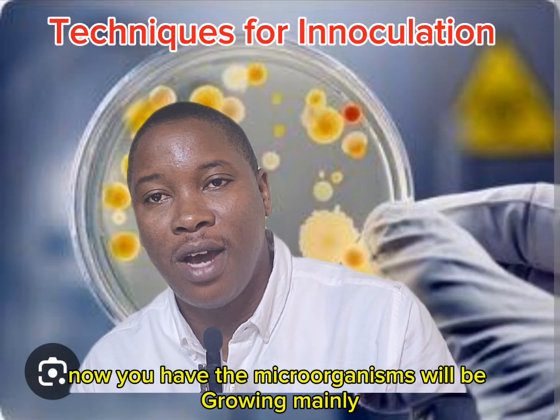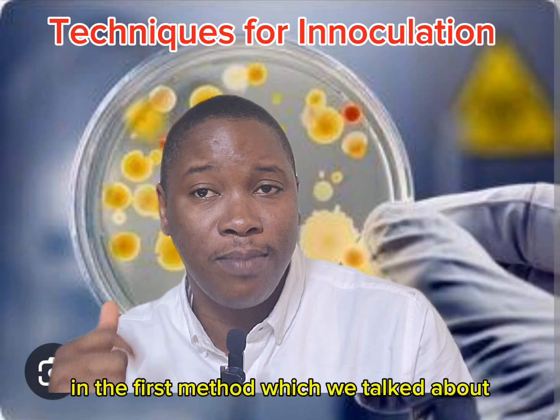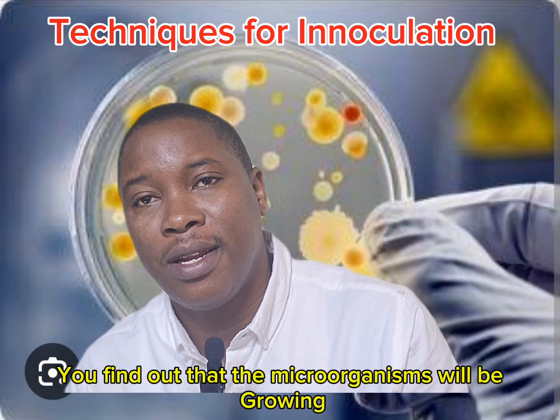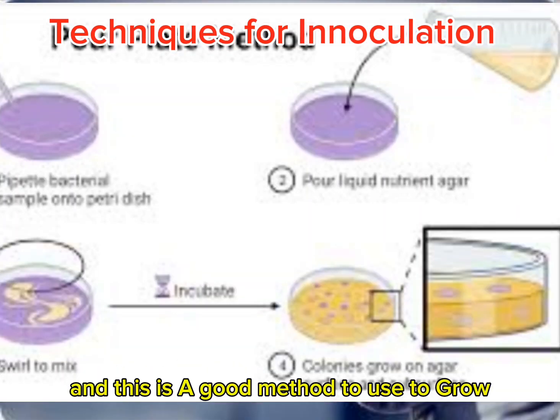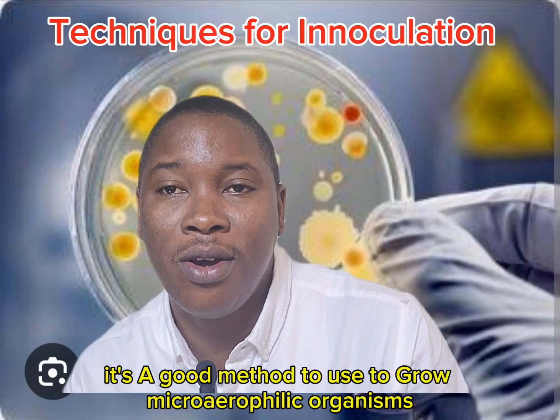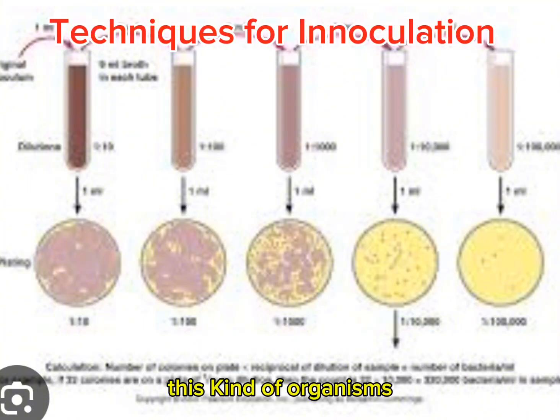In this case, the microorganisms will be growing mainly within the media, the agar. In the first method, the streaking method, the microorganisms grow on the surface of the media. In this second method, they grow inside the media. This is a good method to use to grow anaerobic microorganisms, those that do not want oxygen, and microaerophilic organisms that want just a very little amount of oxygen. So these are good methods for growing these kinds of organisms.